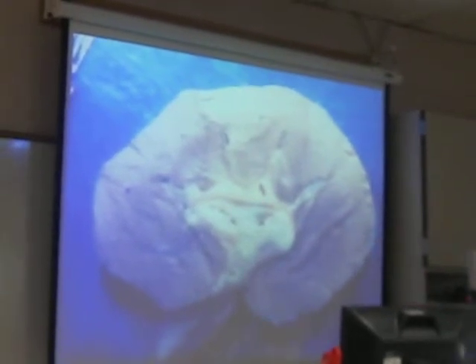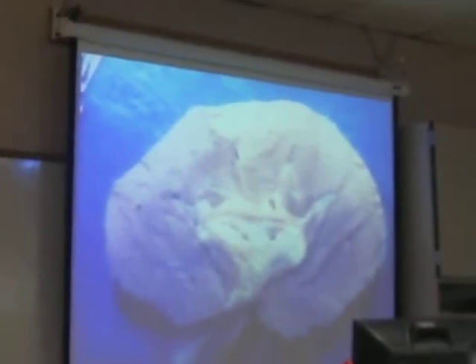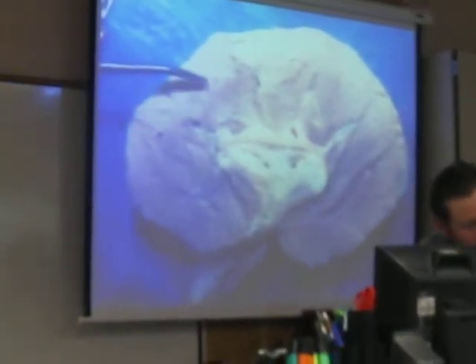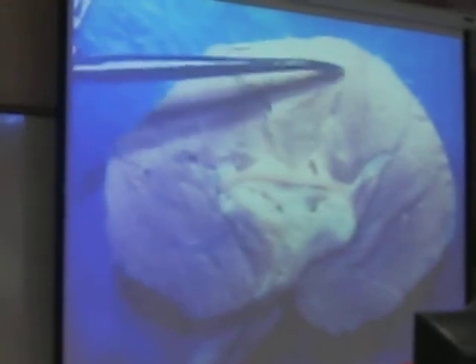After you do that, then you cut the kidney and you're going to identify some of these internal structures. So you can make out, see this kind of lighter area on the outer rim all the way around? Okay, that's the renal cortex. And then all this darker region in here is all your renal medulla.